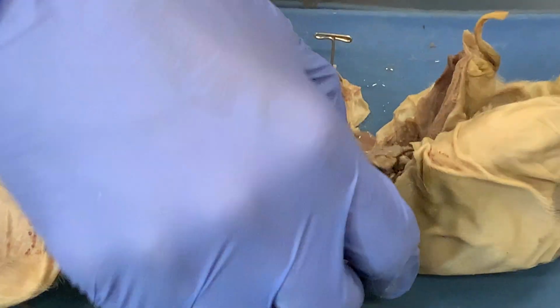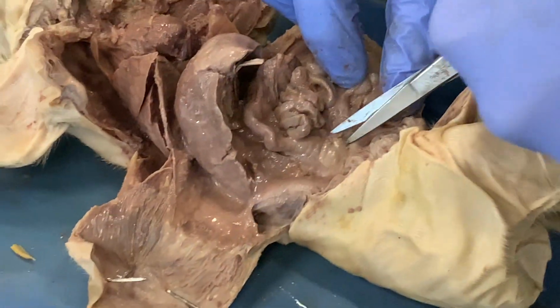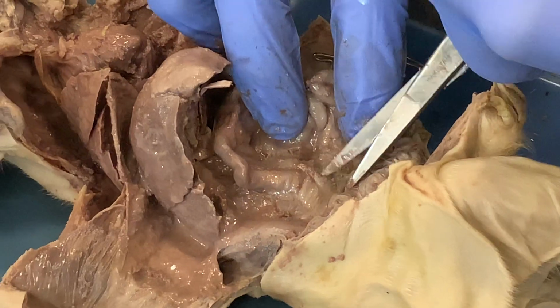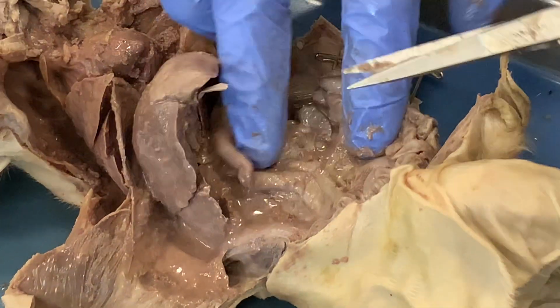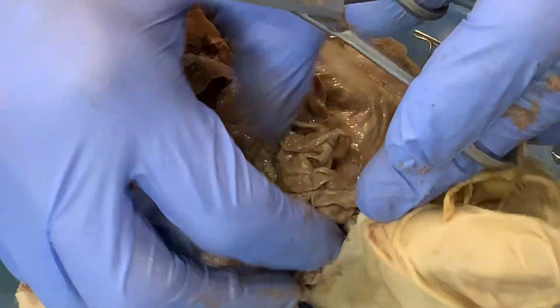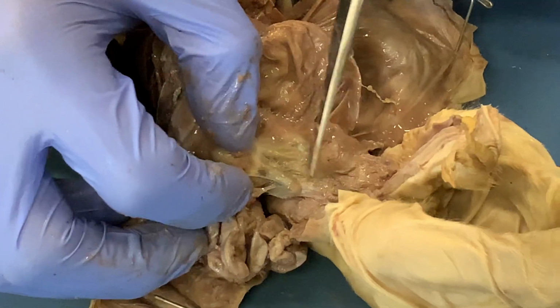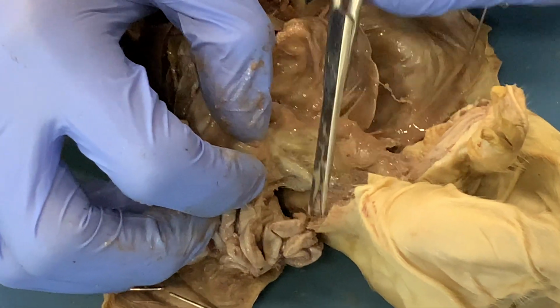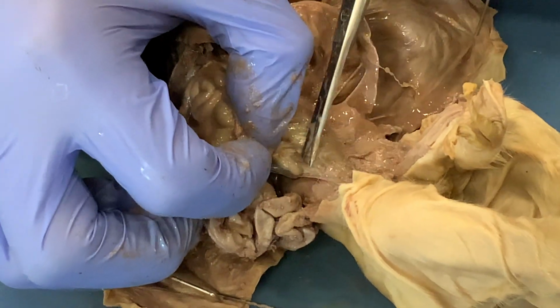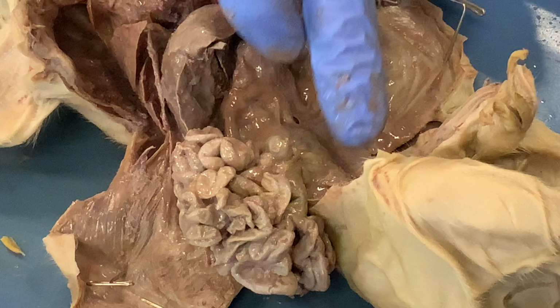Again, if we separate the small intestines from the other organs in the body cavity, just so that we can move them out of the way slightly, we'll be able to see a little bit more of what is happening behind them. Not cutting through any of the organs, just the fascia or connective tissue that holds them in place in the body cavity so that we can move them out of the way.